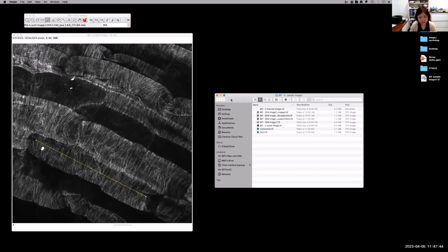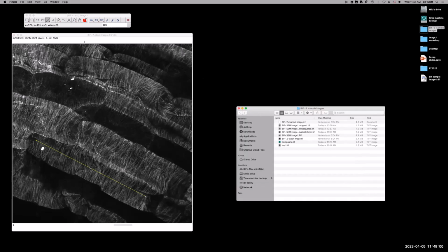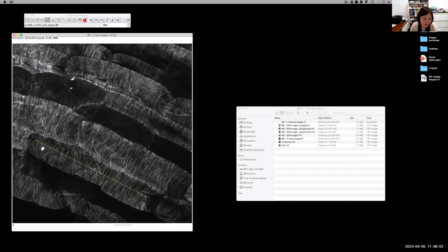And if you want to do analysis, please save each image after you do processing. And Nikki? They're asking, show it one more time. I think based on the profile. Oh, okay. Profile. Yeah.